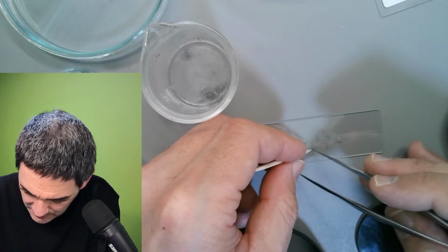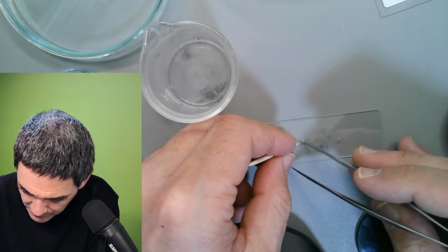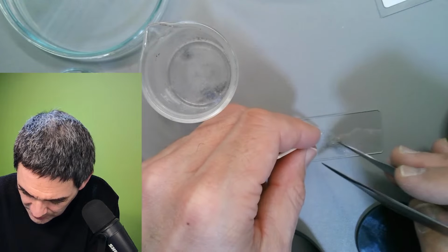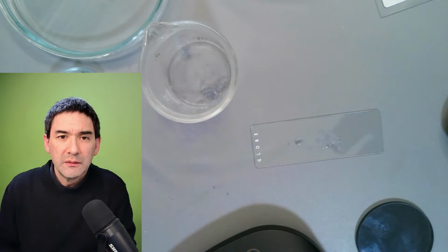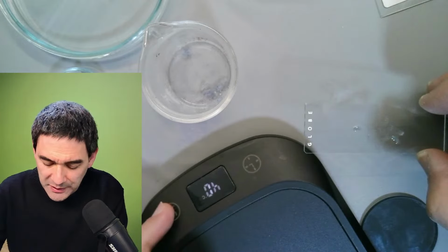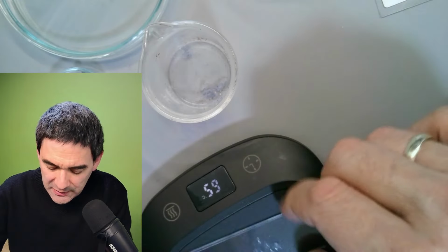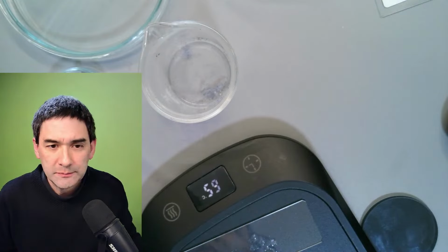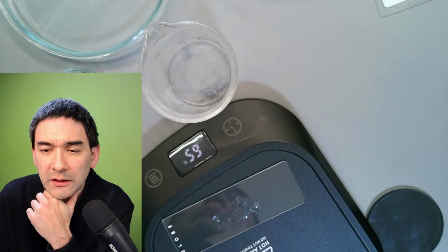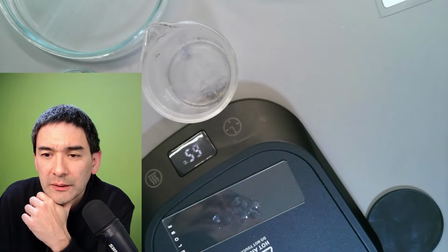And then I'll move on and put the other sample on the microscope as well. Let's just assume that this is finished. I'm going to put it again on my hot plate to evaporate the water. Here we go. While it does this, I'm going to read some of the comments that you've got.